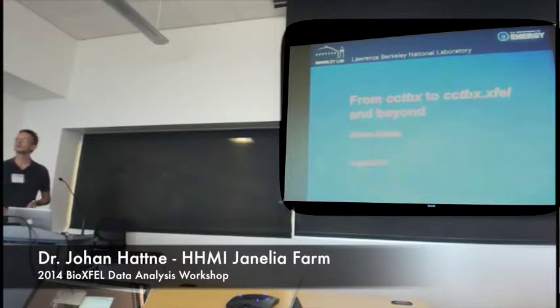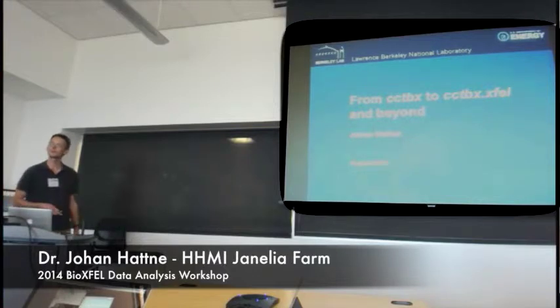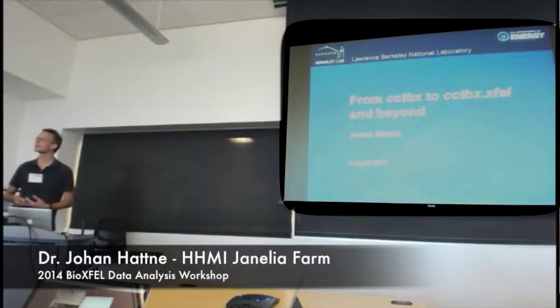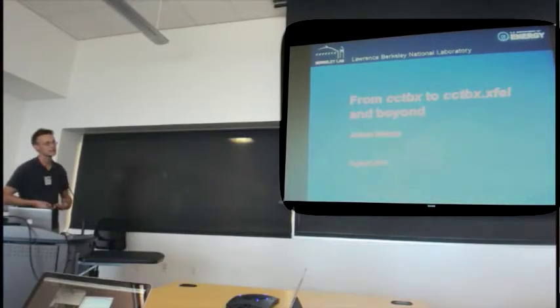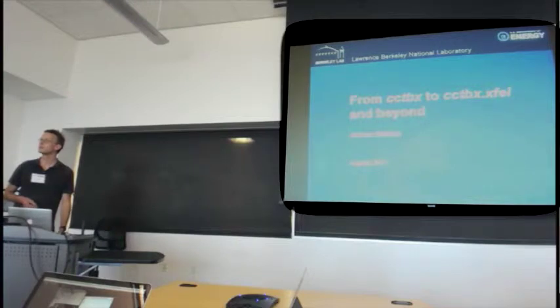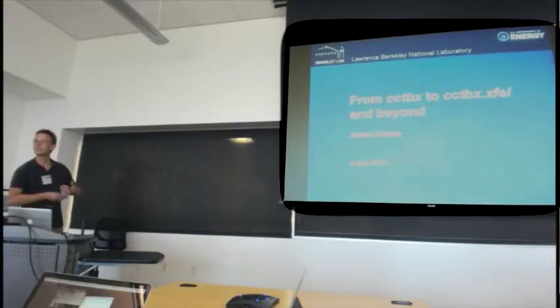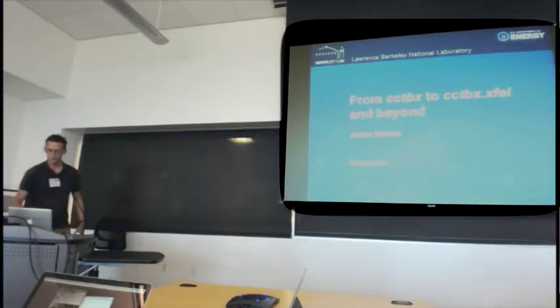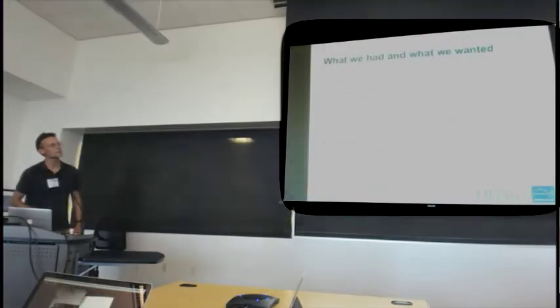What I'd like to talk about in my talk is a bit different from what we've seen before. I'm going to repeat a lot of what we've seen before about cctbx.xfel. But what I'll try to do is give an insight into the history of the development of cctbx.xfel, how it came to be what it is today, why certain things were done in a certain way, and tie in with what Anton said during his talk, that everybody should write their own indexing algorithm. This is how we wrote our own indexing algorithm, except it's actually the whole software suite. So when I arrived in the lab, this is what we had.